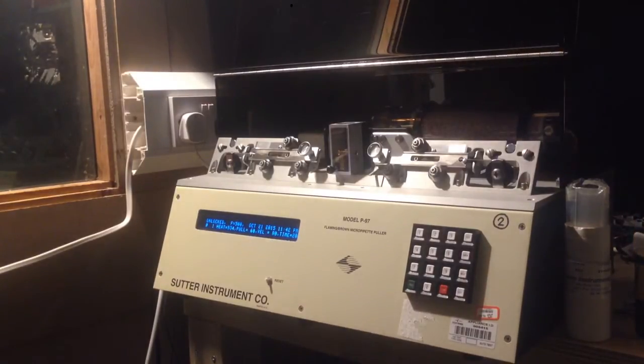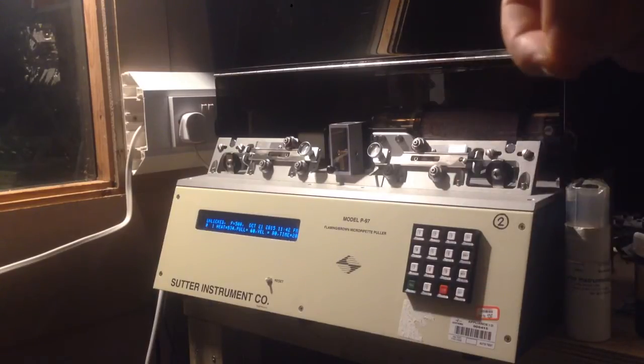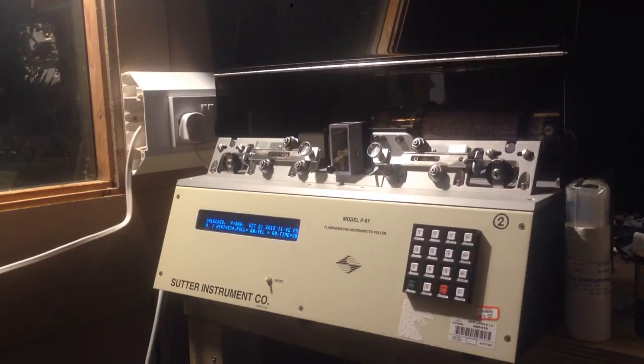You probably can't see very well on the camera, but basically this capillary has been pulled such that the tip is on the order of a few microns in size. You can actually pull nanometer-scale tips with pipette pullers, but it's quite difficult.